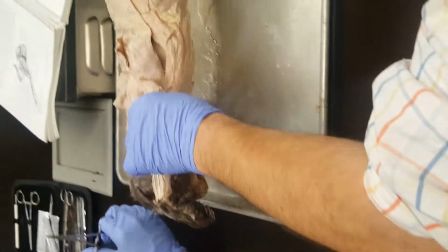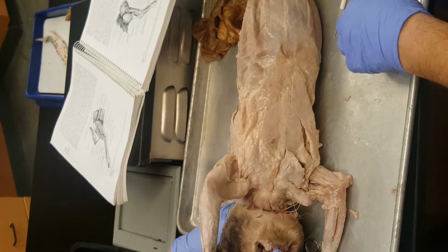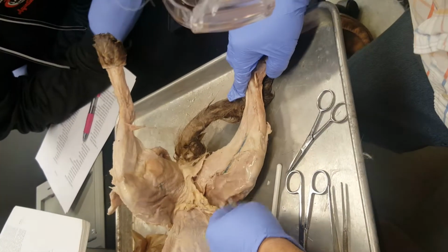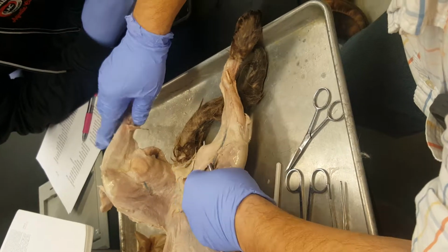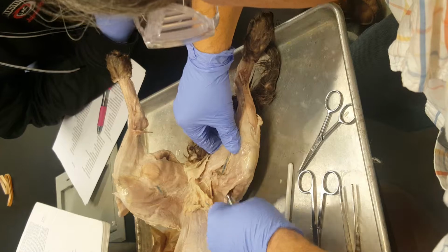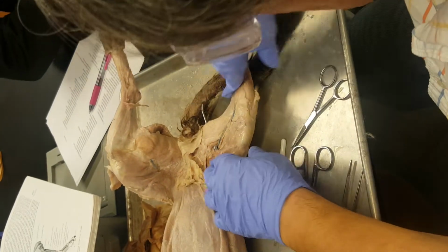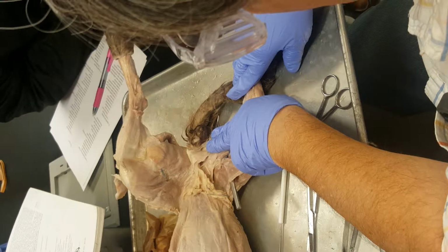Okay, now flip it over. You got a lot done in one day. So here's your sartorius, and whichever side looks best, you're going to do this side over here. Whichever one looks best, leave it alone, then go deep on the other side. When you go deep, you basically just take the probe and go underneath like this, and just cut right on top of the probe. Okay. And then the deeper muscles, we'll get to later. This is sartorius and gracilis. Sartorius is the top one, gracilis is the bottom one.